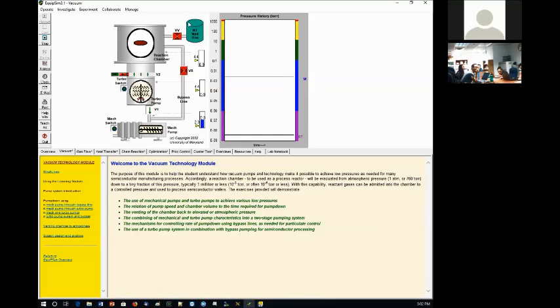There's this nitrogen vent, as you guys can see here. That's the proper way of venting the chambers over a nitrogen line. Let's say your reaction chamber is now under 10 to the minus 9. So I will close this V2, and then I will look at the histogram again, but I will now open this valve. You see, all of a sudden it's vented. And then it's going to say vented to atmosphere.